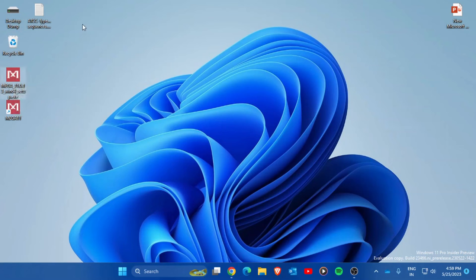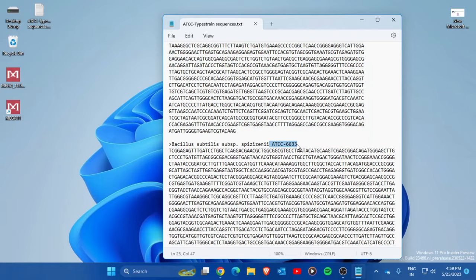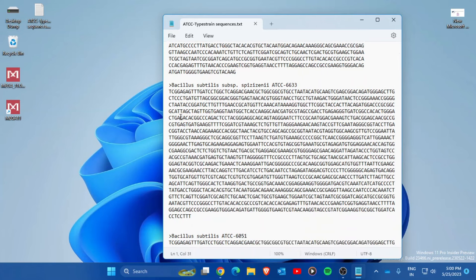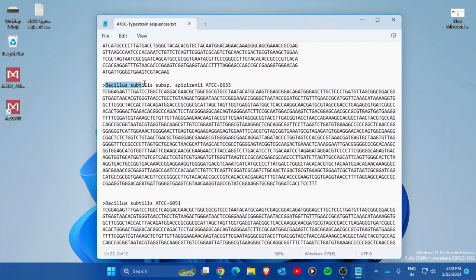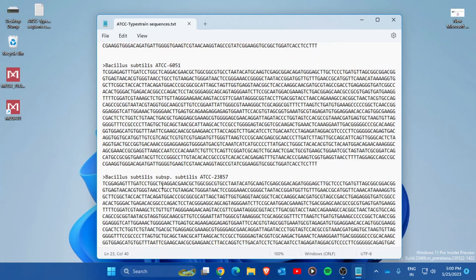Once the software is installed, you're good to go. To construct the phylogenetic tree, I have compiled some 16S rRNA gene sequences in a notepad file. This includes the sequence of my bacterial isolate from the previous tutorial, which I uploaded to GenBank. I have also retrieved sequences of 16S rRNA from different isolates from ATCC, which are the type strains. As you scroll down, you can see sequences from Bacillus subtilis — different subspecies.